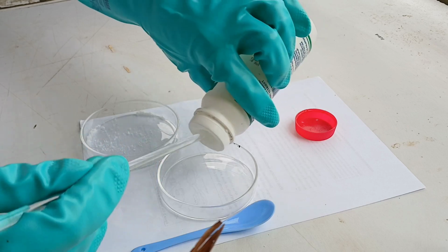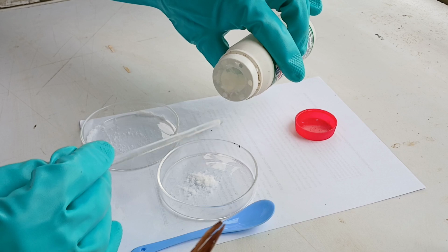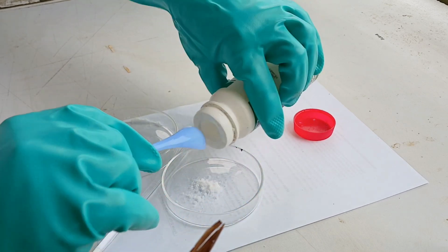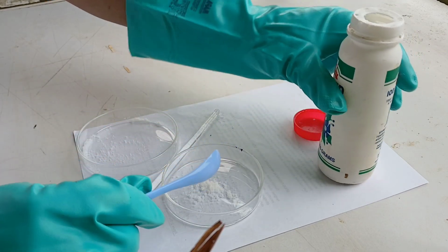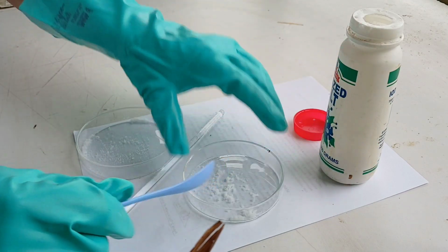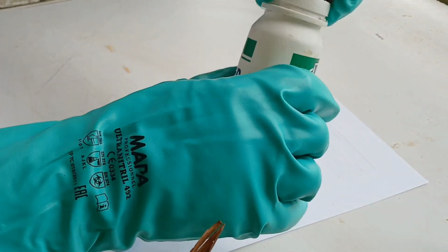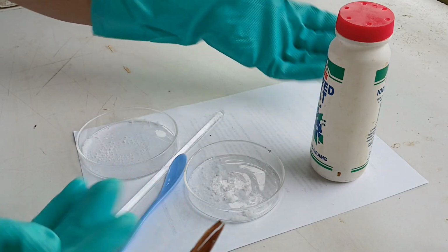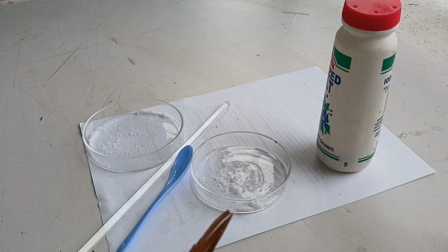And with the use of the stirring rod, you have to grasp the solid chemicals from that container to transfer into the other container. And with the help of the spatula, the color blue, yes, to minimize your time, you could get a lot of sample there as fast as you can. As you can see, we have the sample in another container, and return the lid to avoid contamination of the reagent. And that's it, how to transfer solid chemicals.